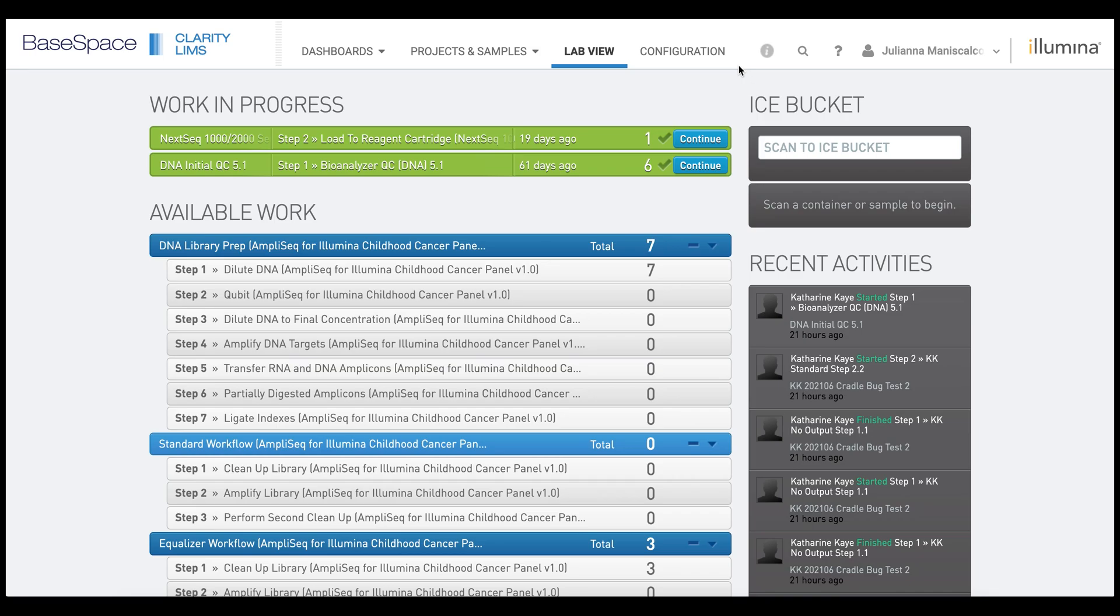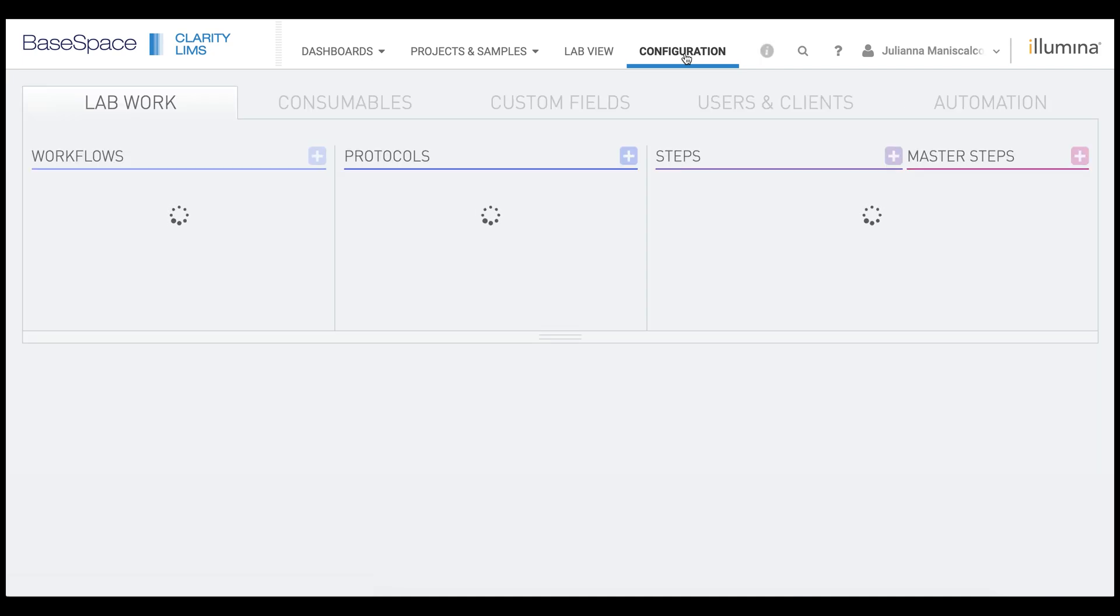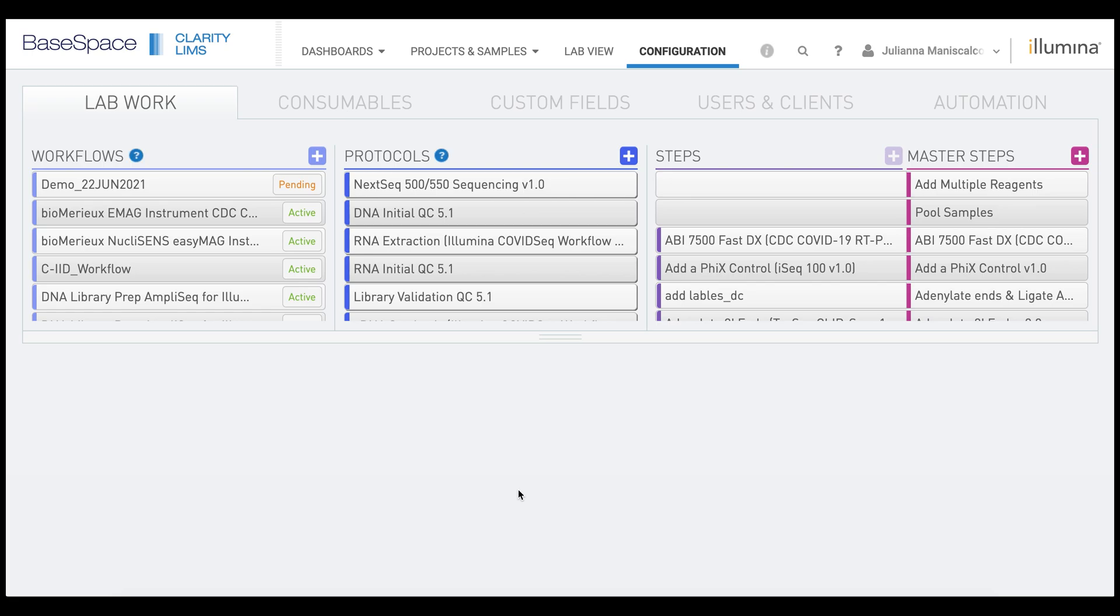First, we want to click on the Configuration tab. Then you want to click on the light purple button next to the workflow column.